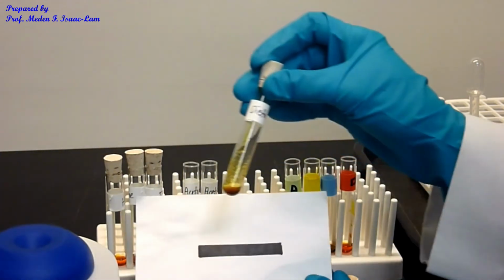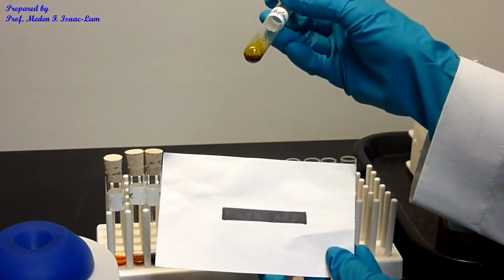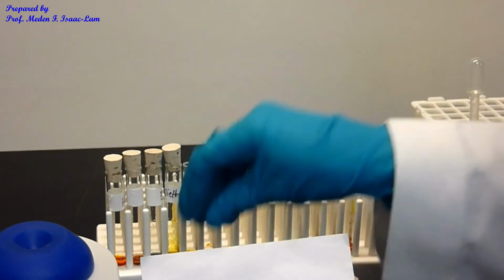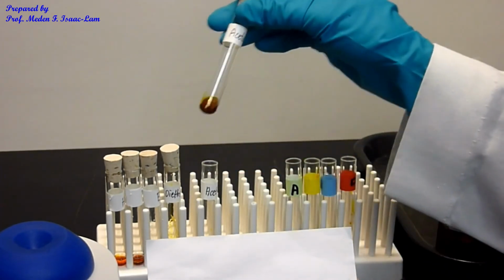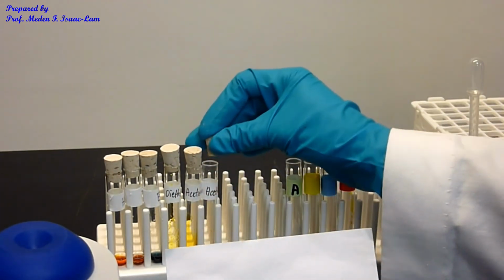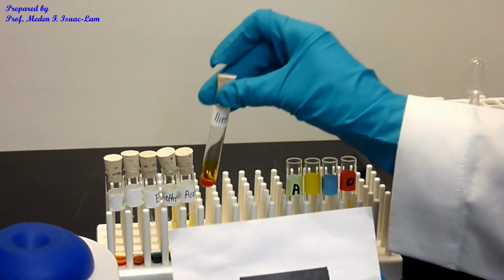It changed color, okay, and then acetone, same, and then acetic acid, same.